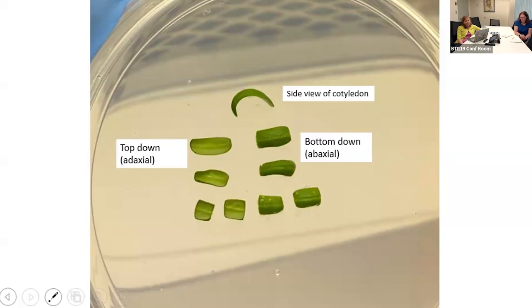Okay, all right, Carrie, Amy, anything else there in the chat? Yes, there were a couple of questions. I'll start with this one from Marissa. Have you ever seen the transformed cotyledons bleaching after a few weeks? I have not come across that with tomato.